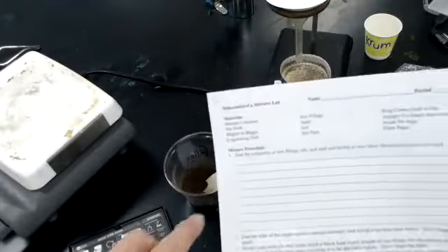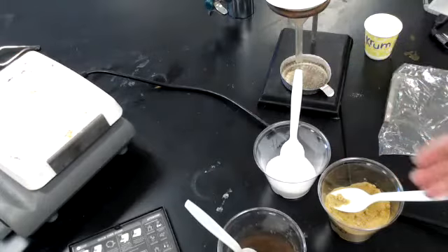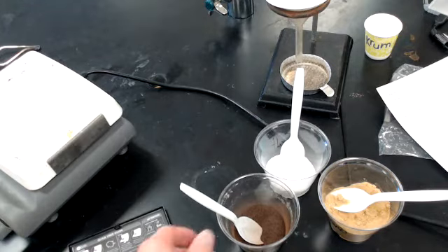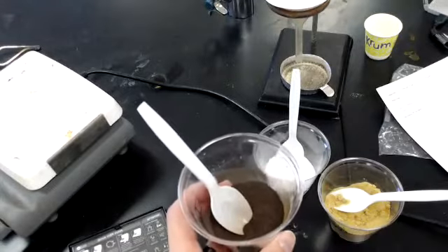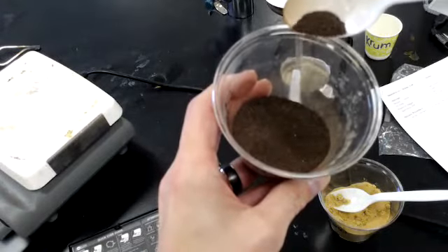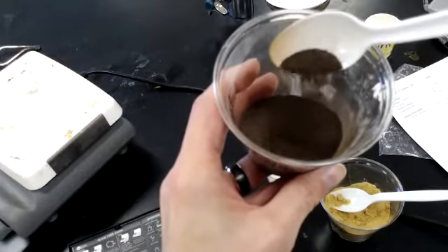We're going to start with making 3 observations of some iron filings and some salt and some sand, again, 3 physical property observations for each, so a total of 9. So I give you 9 spaces on the paper. Okay, I want to give you a good look here. Here's iron filings. It kind of looks like coffee grounds, but it's not. It's small, small, small pieces of iron.